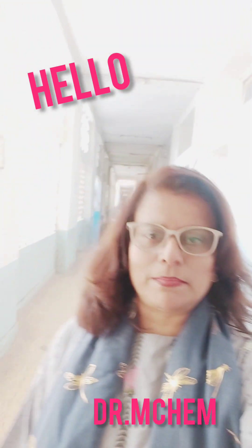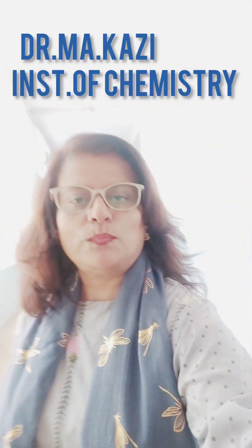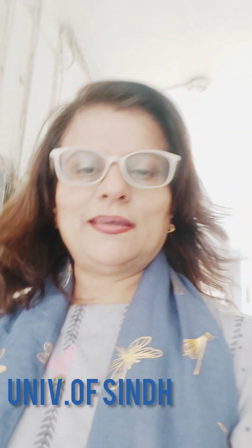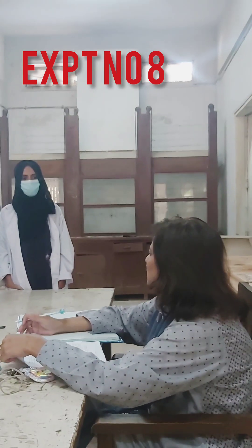Hello and welcome to another video. I'm Dr. Moina Mogul from Chemistry, with a scheme in my hand, heading towards my laboratory, which is hopefully filled with my students — and yes it is. Students are waiting. You can see a half-empty lab, so I will continue in a minute. Today you are going to start the preparation of nitrobenzene — that is para-nitrobenzene.